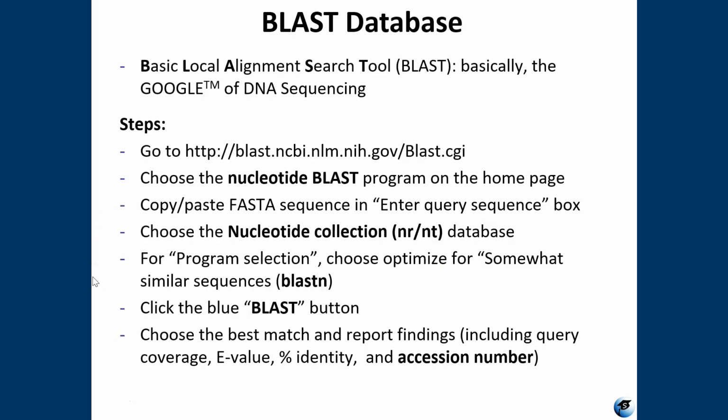I'm going to run the sequences for you, and I'll post the sequences on Moodle, and then if you want to, you can go ahead and run your sequences through the BLAST database. If you want to wait, then that's fine too. We will do these together when we meet for class. If you can't stand the wait, or you just want to try it out, you can go ahead and do that. I'm going to run through the process with you here.